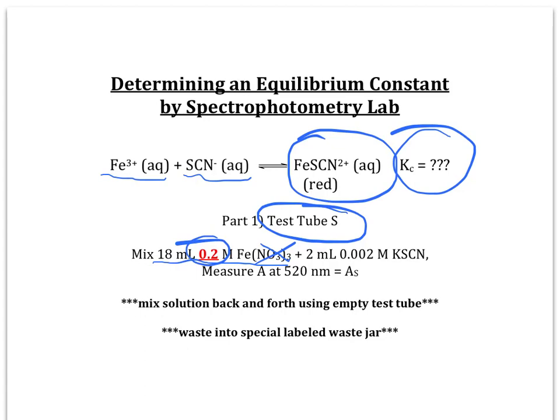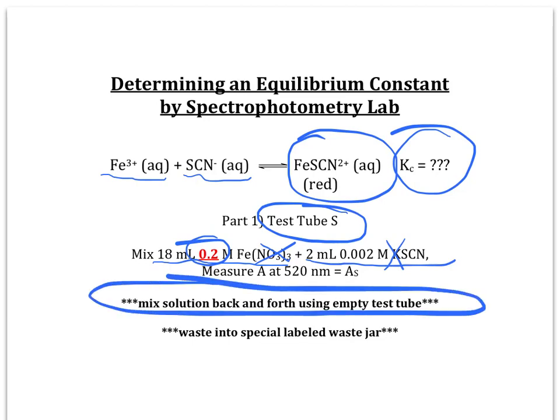You're going to mix that with 2 milliliters of 0.002 molar KSCN solution. The K+ is a spectator ion in this case, so just the SCN- ions react. As always, when you mix solutions, mix back and forth using an empty test tube to make sure it's thoroughly mixed, and then get the absorbance at 520 nanometers. You can write down that absorbance and call it As. We're going to use that value As in the calculations later on. Also very important, when you're done with any of the test tubes in this experiment, be sure it doesn't go down the sink, but instead goes in the special labeled waste jar that we'll provide for you on the instructor's bench.